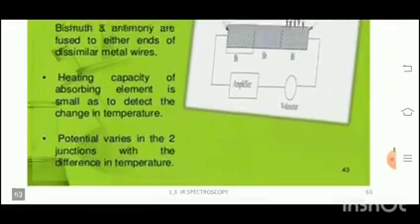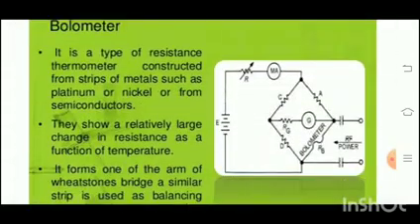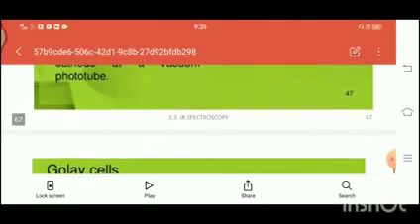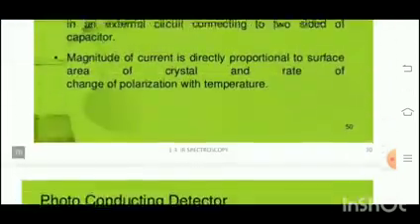This is a thermocouple, and this one is a bolometer, and this is a Golay cell. These are all the detectors used in the IR spectrometer.